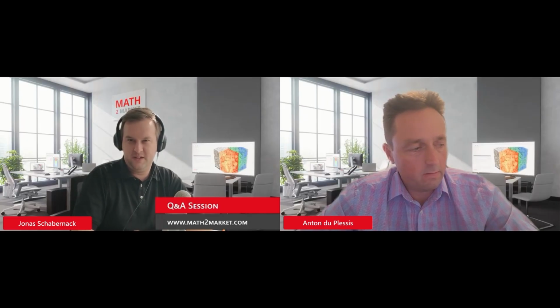I'm not aware of contact resistance as a property that we employ in our simulations. Maybe you can comment on that, Jonas. I'm not an expert really in the mechanical simulations, but I think there is something for contact resistance that you can do. It's called the elastic module. I think it is there, but I don't have direct experience on this.